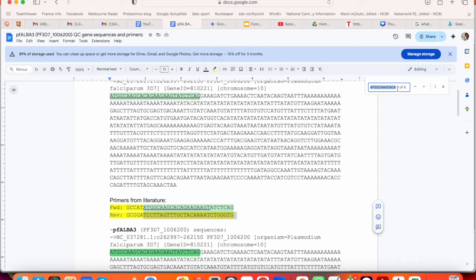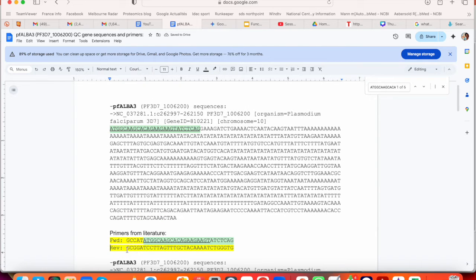So once the software gives you some sequences that it thinks are unique, you still have to check a few things to make sure that you can go ahead and get those sequences synthesized. And there are tools again that you can use. So you want to look at whether the primer sequence can fold back on itself and form a secondary structure known as a hairpin. If it can, then you don't want to proceed with that kind of sequence.